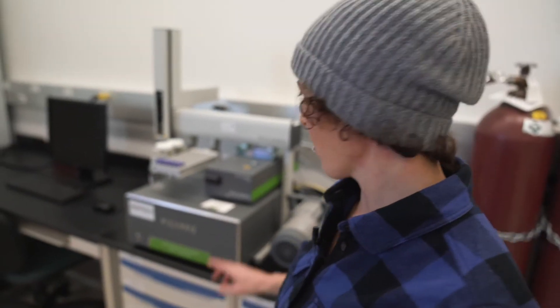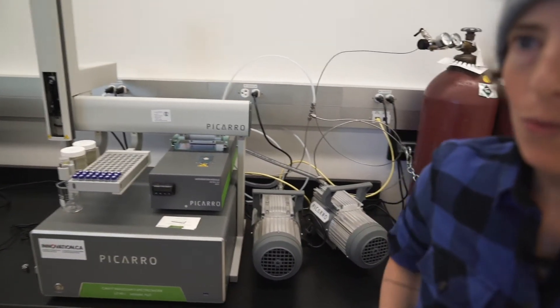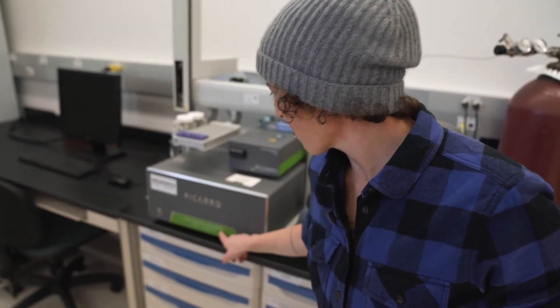What does this Picaro machine do? This Picaro is an oxygen isotope analyzer. What it does is it measures primarily the two different main isotopes of oxygen, which are oxygen 16 and oxygen 18. And it uses cavity ring-down spectrometry to separate those two isotopes, because isotopes have different weights.